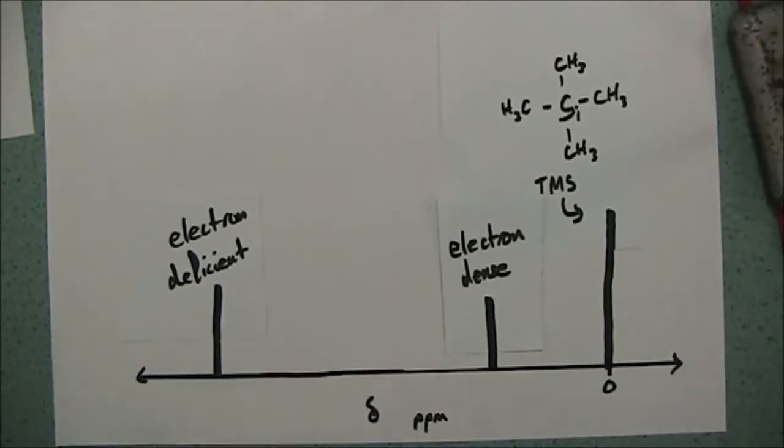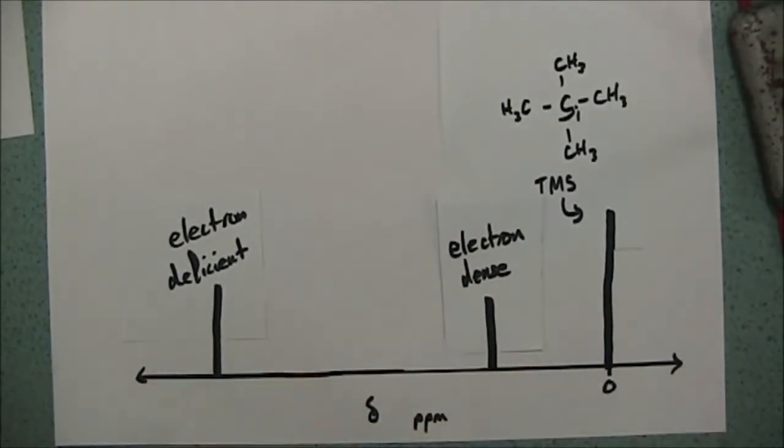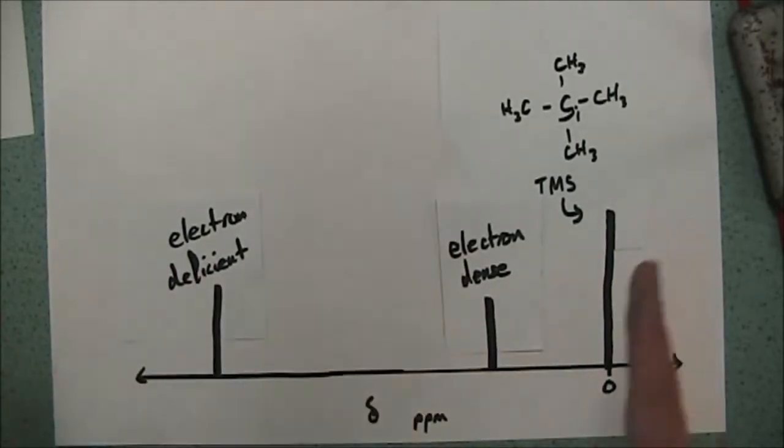And what we also find is that different atoms occupy different parts on this scale anyway. So if we zoom in on only the range that contains hydrogen, we can see only the hydrogen atoms on one sketch. And if we zoom in on the range which says just carbon atoms, we can say, okay, all these peaks are due to carbon atoms.